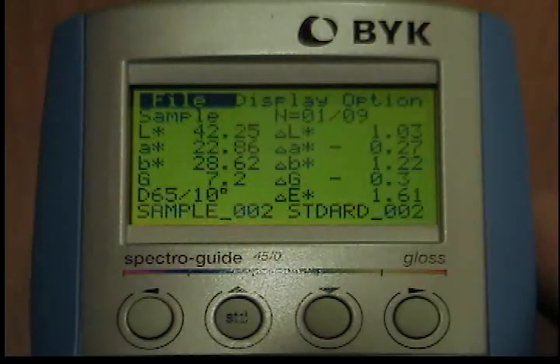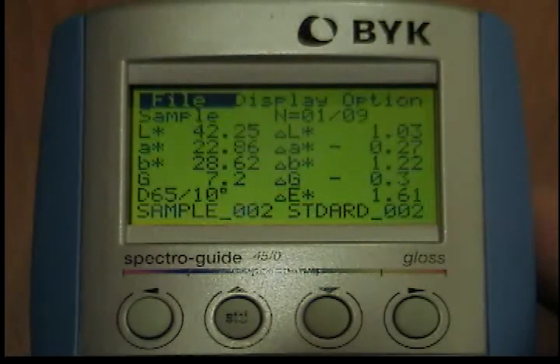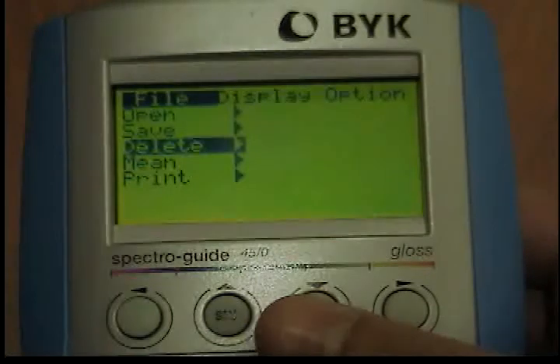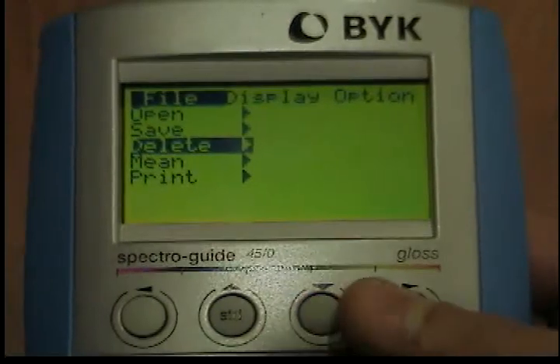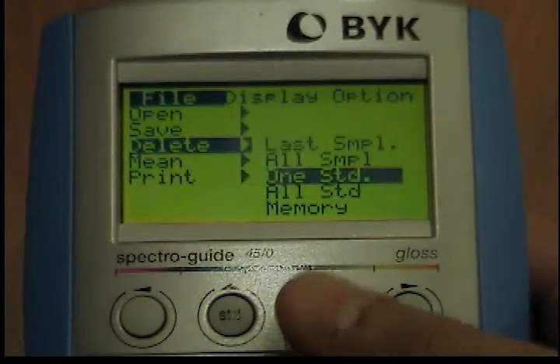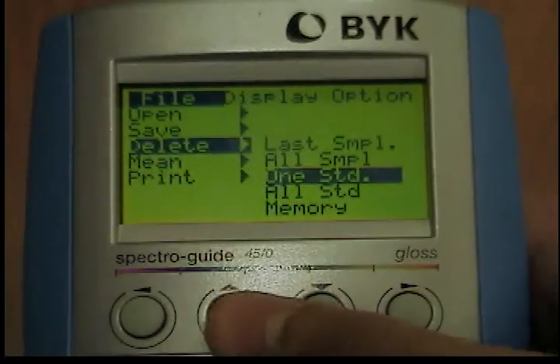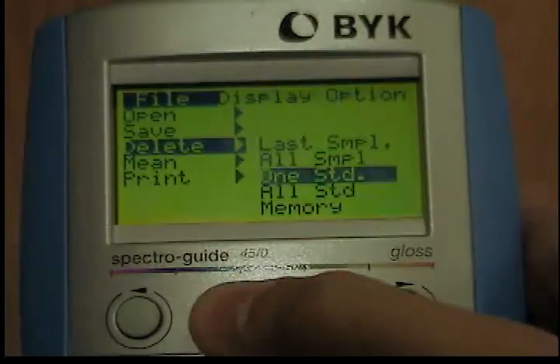Use the cursor buttons to cancel the operation. Last Sample indicates that the most recently stored sample will be deleted. Memory indicates that all samples and standards will be deleted.